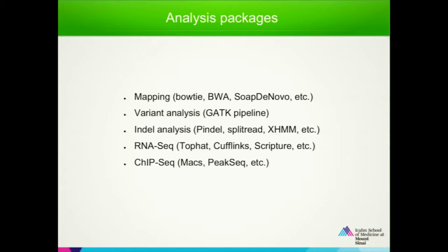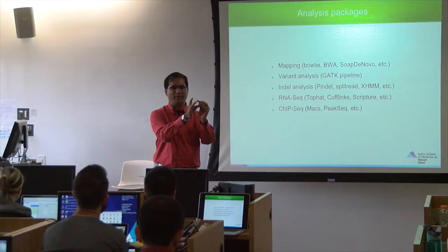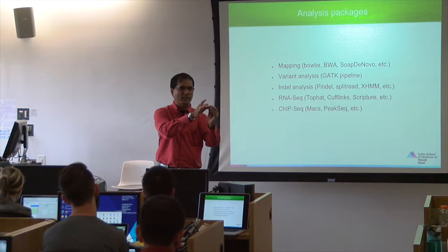And then if you have ChIP-seq, there are different techniques where analysis methods were developed. Some of the popular ones are MACS, which is being used now. The earlier one was PeakSeq, where, like in RNA, if you sequence a particular region after immunoprecipitation, it is highly enriched in the sequencing. That shows that the transcription factor is binding to that region. Okay, that's how you analyze.